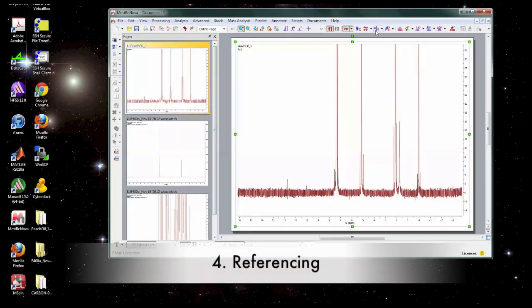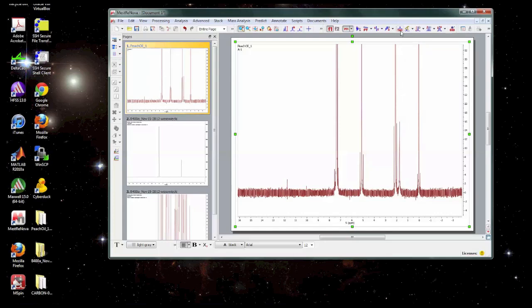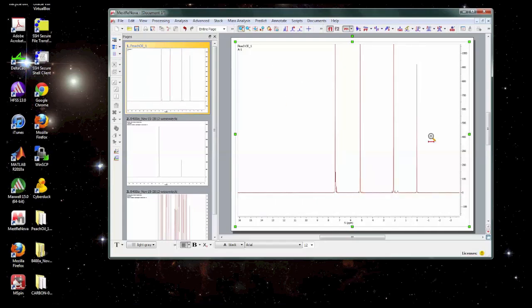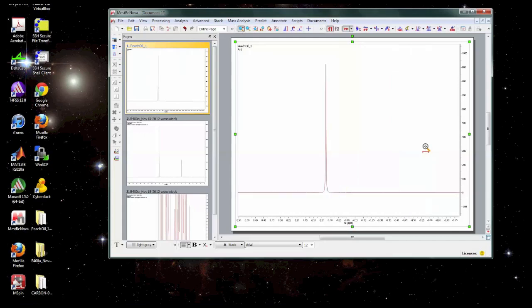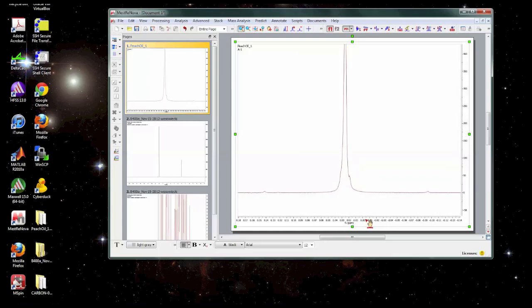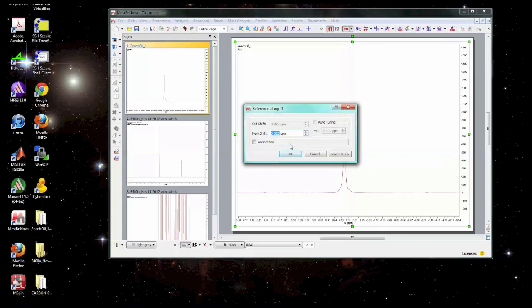Okay back to this spectrum. We have done the phasing. We've done the baseline correction. The next thing we can do is referencing. Now it says TMS. So one way that you can do referencing is if you have TMS in your spectrum, which is tetramethylsilane, it should be set at zero ppm. So we can zoom in by using the magnifying glass here on a peak that we want to use as a reference. And you might see that it's not exactly at the location it should be. So what we can do is click on this reference button, find the peak, and then set it to whatever value it should be. For example, zero ppm.